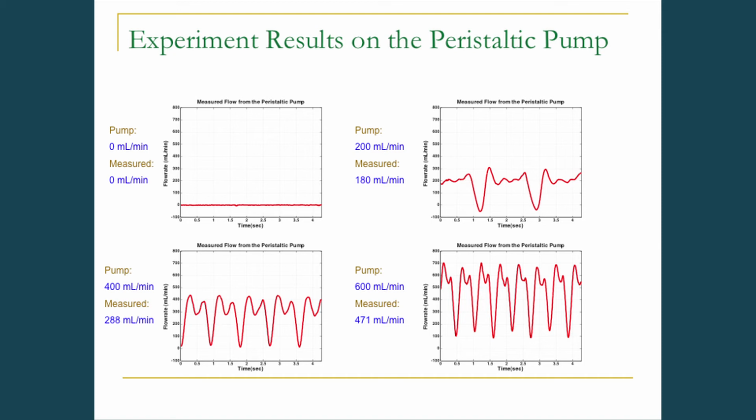The second flow rate, just an interesting note on that, if you notice during the single cycle, the flows actually go negative for about 0.2 seconds in a 2-second waveform, and our customer was not aware that that was happening. What that turns out to be is as the cam in the rotary mechanism comes off, the tube expands out, creates a negative pressure in the tube, and actually sucks the liquid back. So the result of that is that fluid is actually flowing in the negative direction.